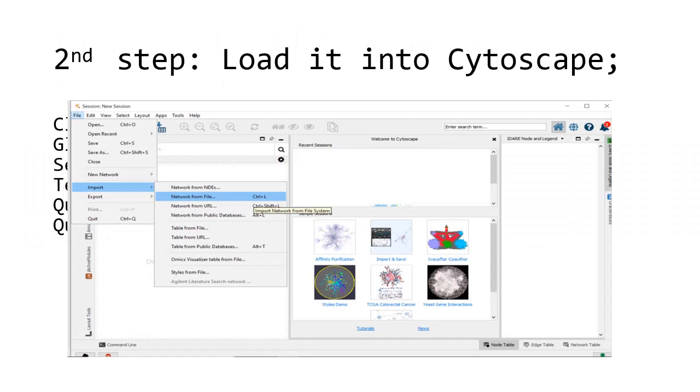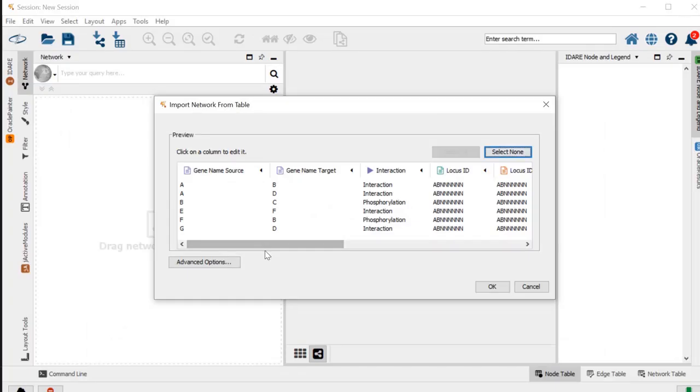To create your network from the table file that we created previously, you need to go to File, then select Import, then select Network from File, and then you select the Excel file that you created previously. Once you select your Excel file, this is what should appear to import network from table.